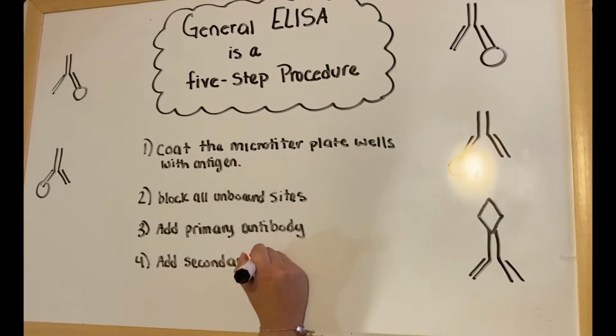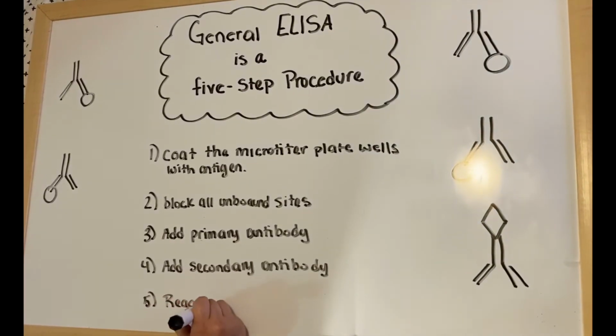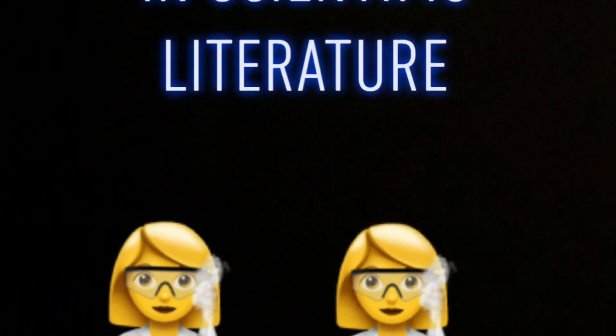We will now be moving over to an example of application of technique of ELISA which was found in a scientific article.